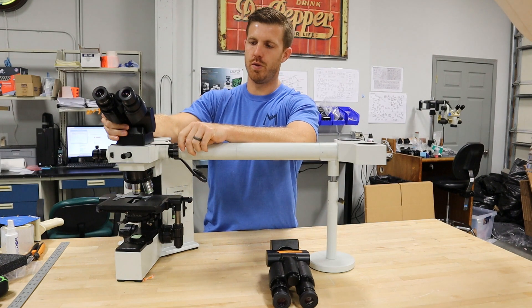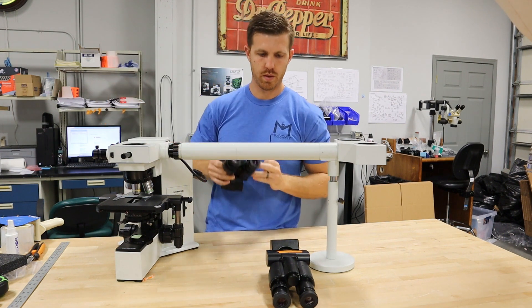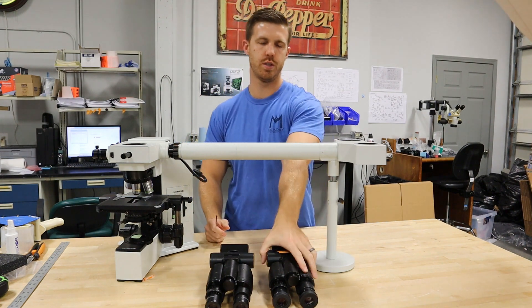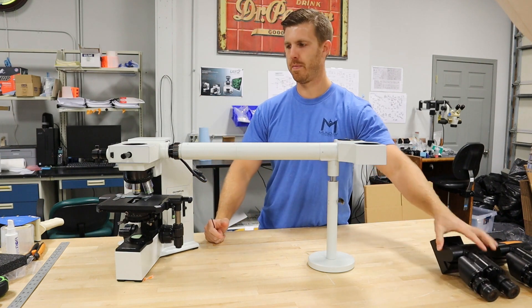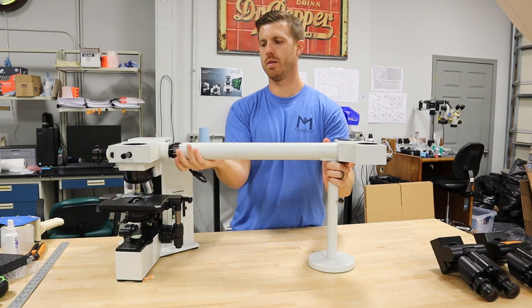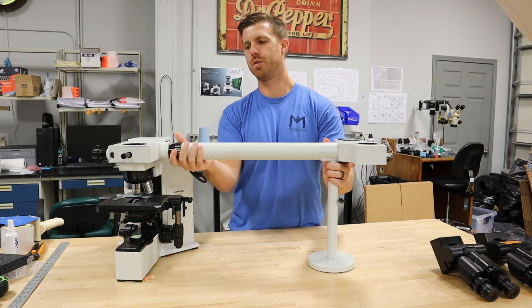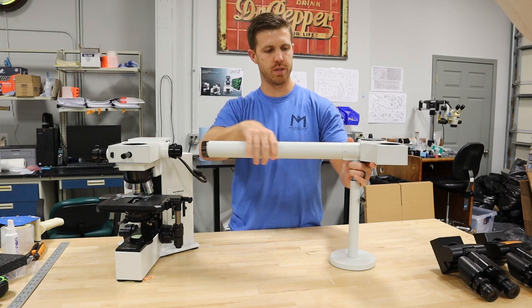Then remove the other head. Once those heads are removed, you're going to just set them to the side. This collar here, you can rotate. Once you rotate that collar off, you'll feel it get loose and you can slide this whole bridge assembly off.